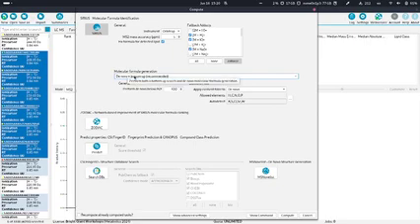What is selected by default, this de novo plus bottom-up, will do de novo only for the features below this mass, which is in this option. Below this option, we have perform de novo below m/z, and then you can select something here.